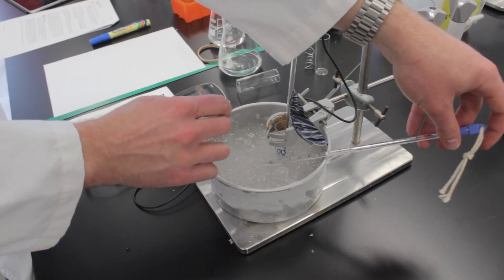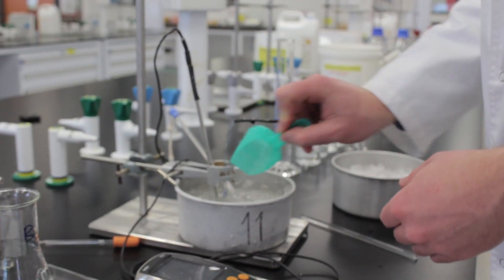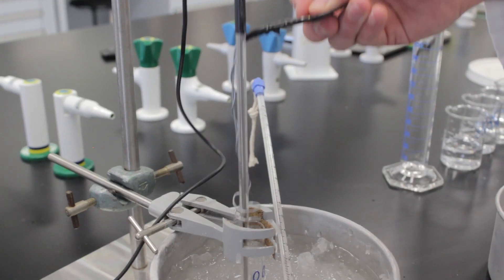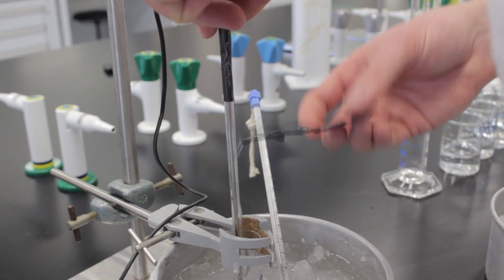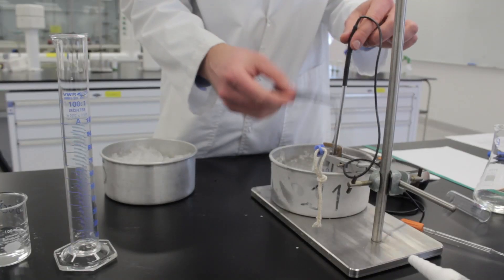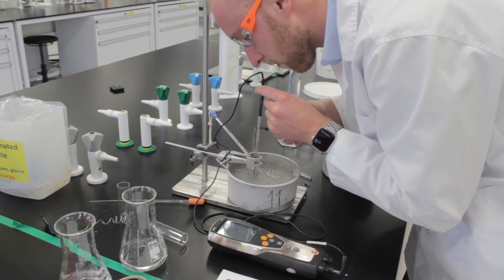Make sure that the ice bath is at the correct temperature and add more pool salt if necessary. Start mixing the solution by moving the wire thingy up and down vigorously. It should take a few minutes for the solution to start freezing. Keep an eye on the thermometer.